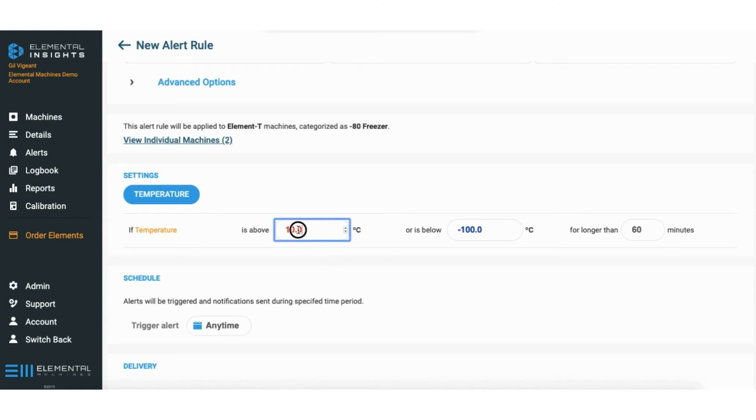So let's quickly put in my temperatures. These are the temperatures that my team felt most appropriate, and you should do the same as well.